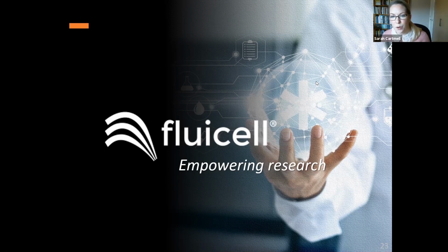Thank you, Gavin. The next question is from you. You asked, what is the time frame for the liquid exchange of the biopen, and what is the surface area covered by the liquid at the tip?